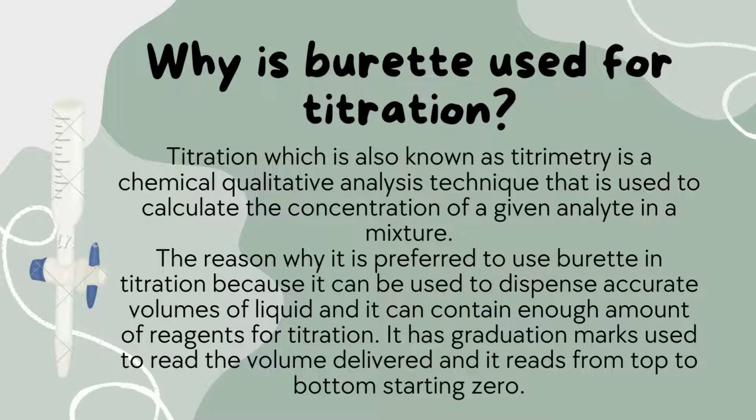So let's get back to the question. Why is a burette used for titration? You know, the reason why it is preferred to use a burette in titration is that it can be used to dispense accurate volumes of liquid and it can contain enough reagent for titration. It has graduation marks used to read the volume delivered, and it reads from top to bottom starting at 0.